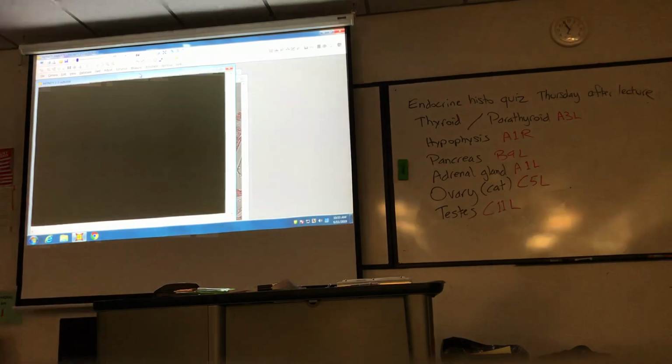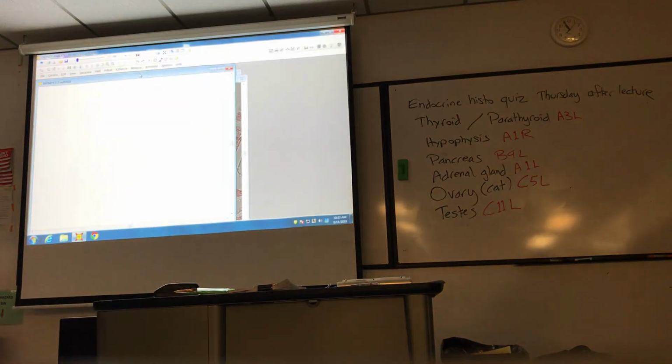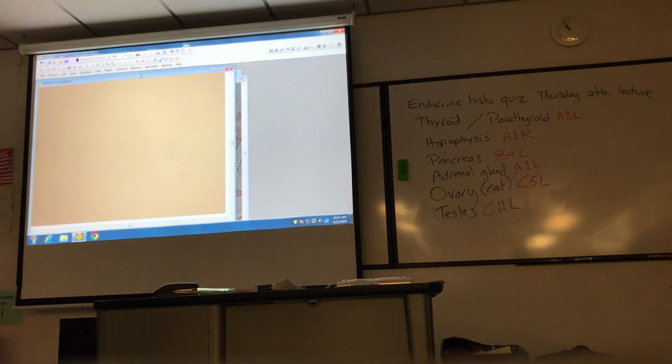Pituitary. Go back to low. Bring your stage all the way down. Remove the slide, put the next one in. I say all that because I expect you to view slides in the same way. And know that slides are put away incorrectly all the time by students. So be sure when you grab a slide from the correct location that it's not the wrong slide.